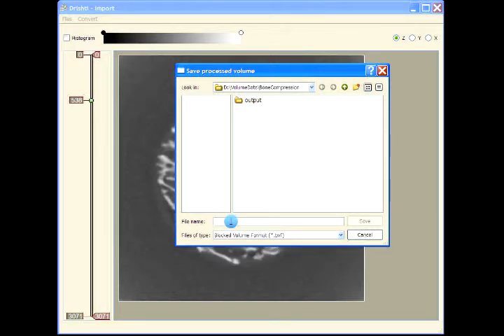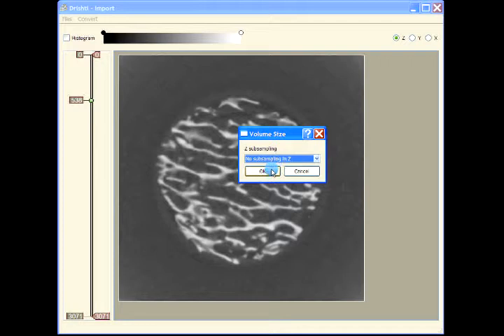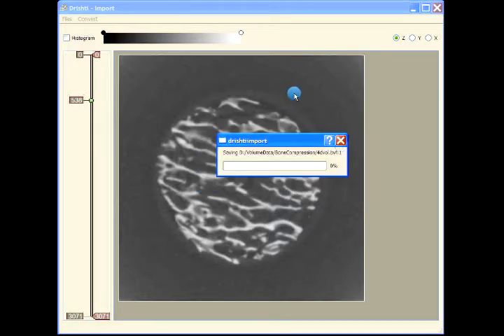So what we'll do here is use say 4D volume, for example, and then we'll go ahead and save. Now what it's doing is saving the data into 2 files. The 4D vol.bvf is the header, which contains the metadata for your volume, and then the actual volume will be saved in hdf5 format, that is in a .h5 file.